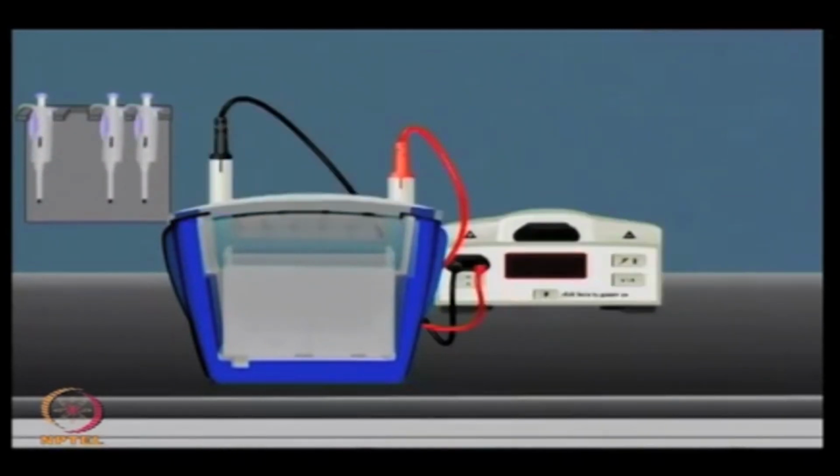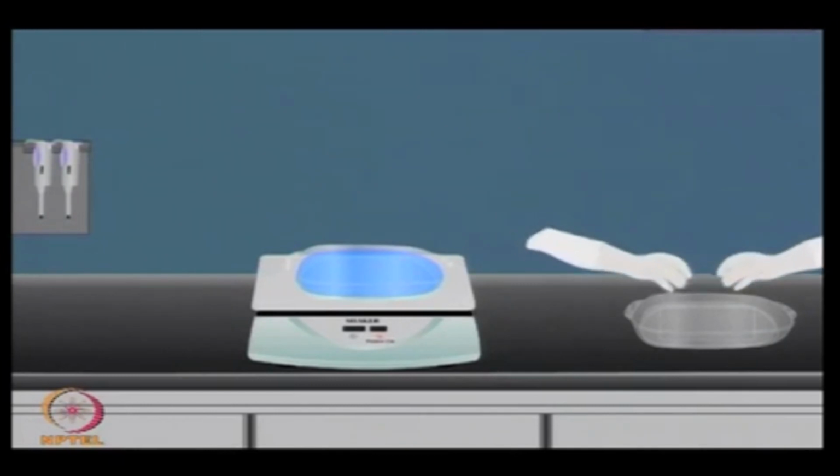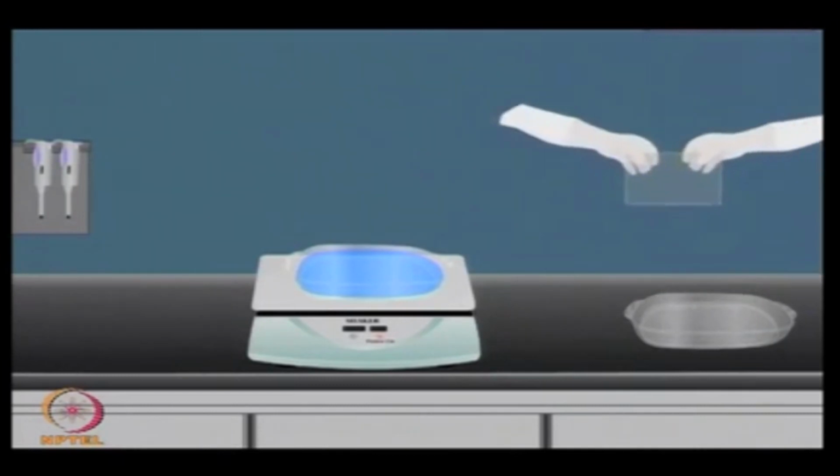and now ensure that the assembly is properly sealed and buffers are properly placed, so that proteins can be separated based on their molecular weight. Depending on the gel length, you can perform the second dimension separation for a few hours. After second dimension separation is done, then we can perform the staining and de-staining.